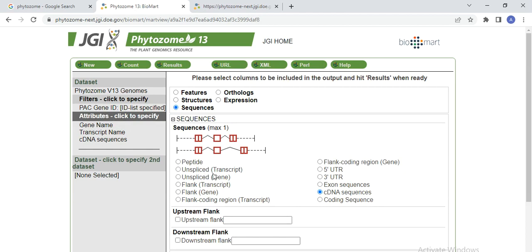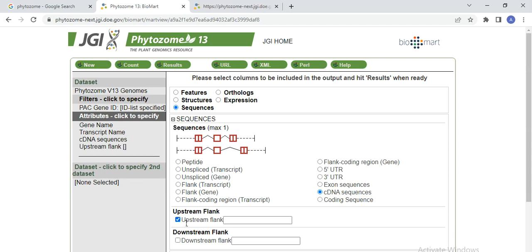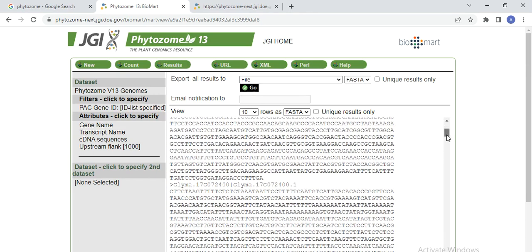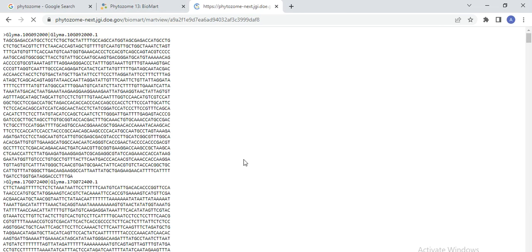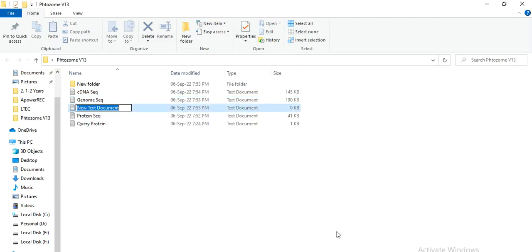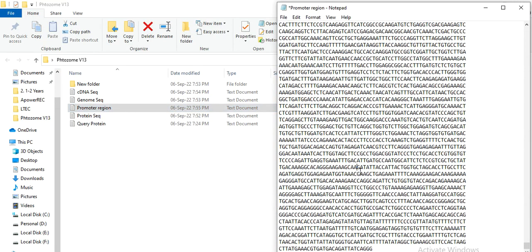There are also other sequences, like unspliced transcript or gene, which you can also download the same way. If you need promoter regions — that is upstream of your gene — click Upstream and enter how much region you need, for example 1000 or 1500 base pairs. Write the number here, then go to Result. This is your promoter or upstream region — select all, copy, then make a file named promoter_region and paste it.